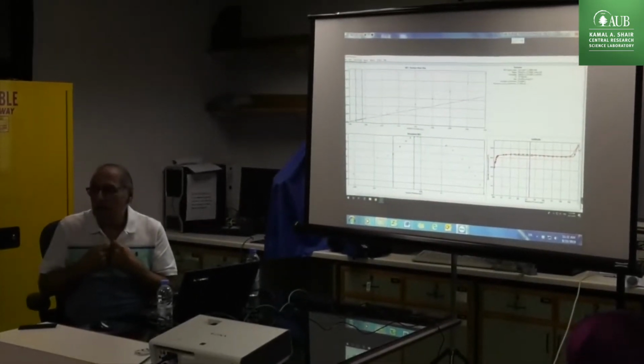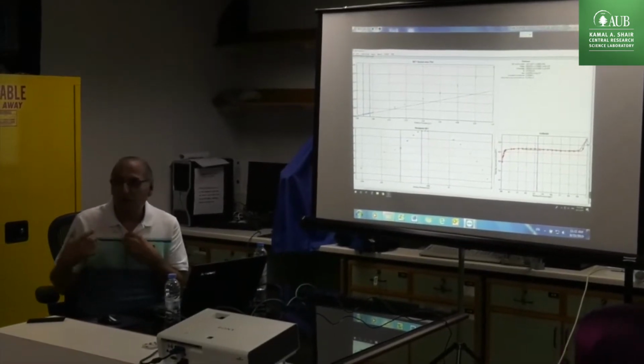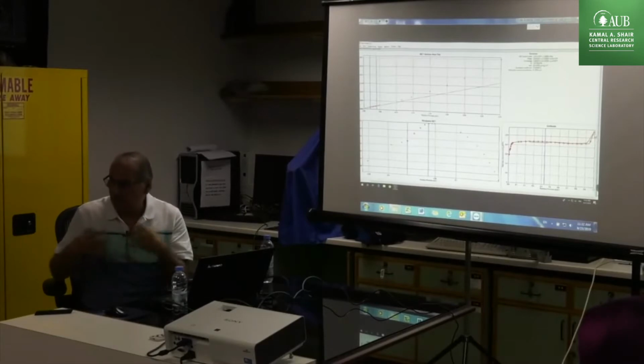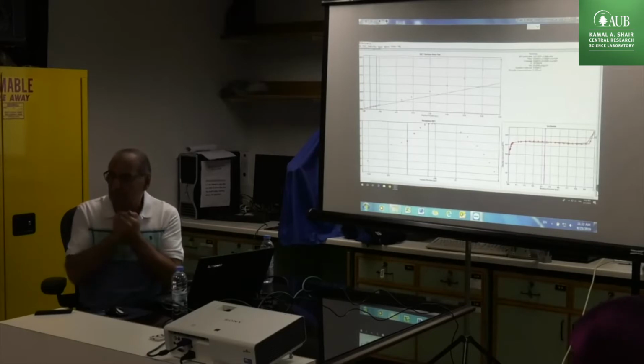How could I know if it's large pores or not? If it's a macropore sample, with very large pores, I should go to a different technique called mercury porosimetry. But we don't have mercury porosimetry here, and I need to know what's going on. What I can do is compact the sample and form pellets from it, putting some pressure on it.